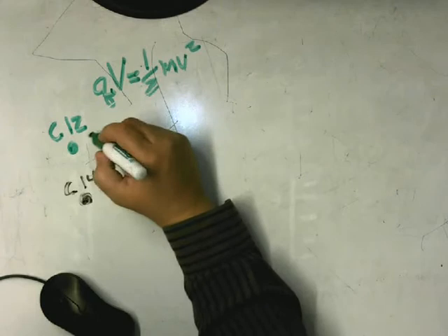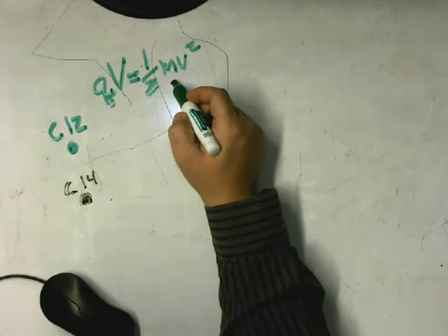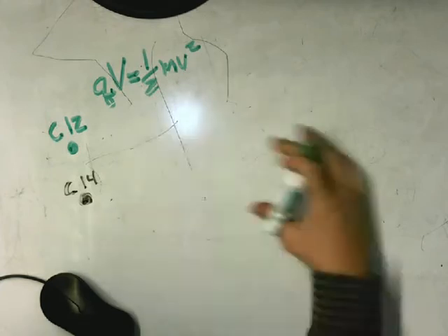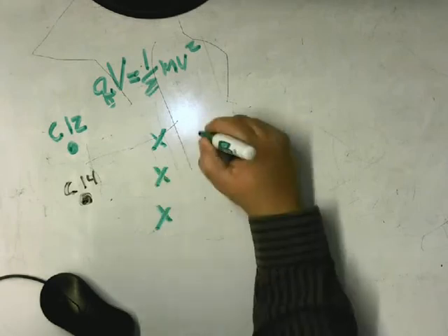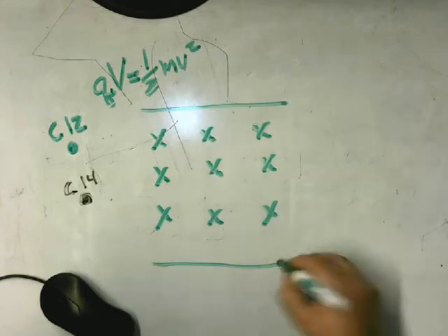I can select out this one, or any one further on down the line, as long as they have different mass values. Now, molecularly, that might be more of an issue. But atomically, that's not. Okay? So as they're traveling through there, the next section has both a magnetic field and an electric field. Okay?